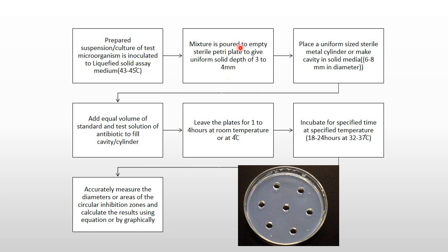Then the mixture is poured into an empty sterile Petri plate to give a uniform solid depth of 3 to 4 millimeter.